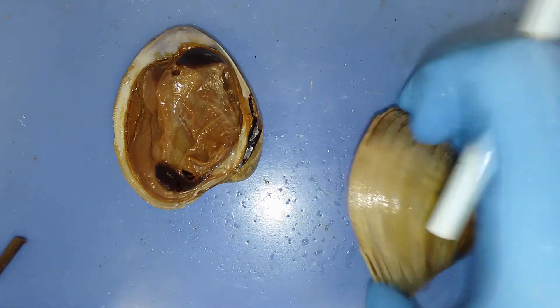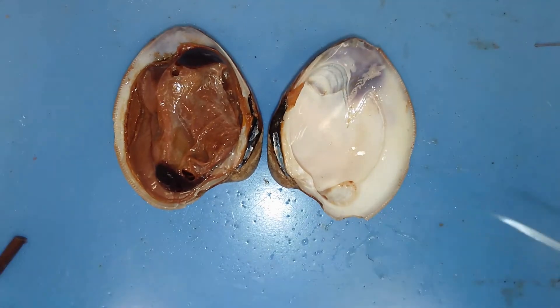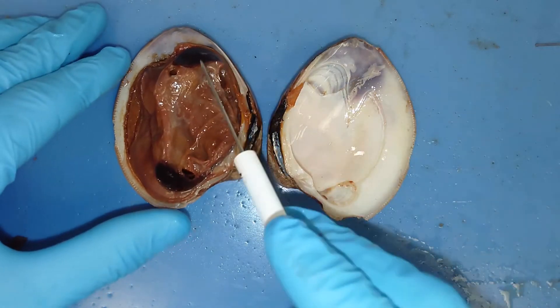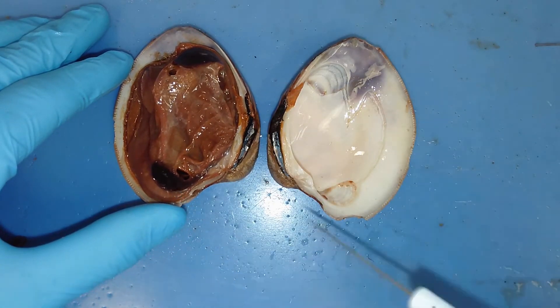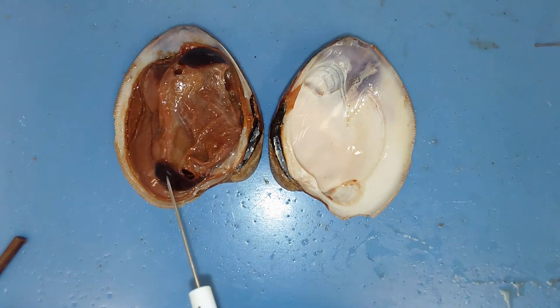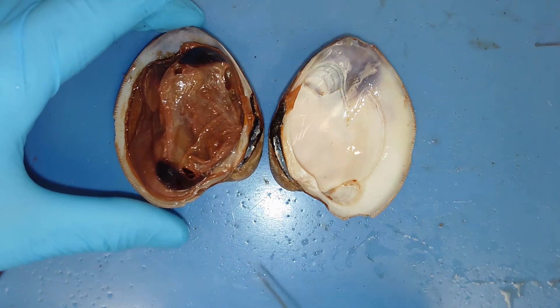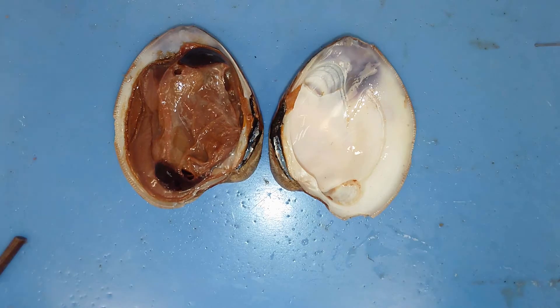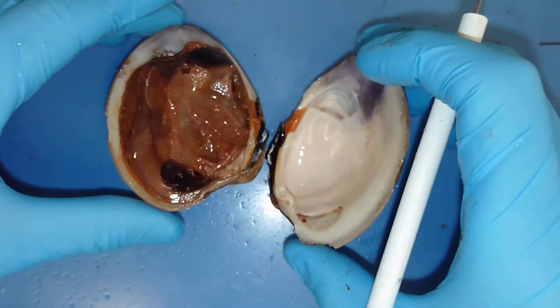In class Bivalvia — bi meaning two — we have two shells. These two very dark structures here are what attach to the shells and keep them closed. These are called adductor muscles, and these adductor muscles can close the shell with a lot of strength and keep it closed for a very long time, but they can't open with a lot of force.